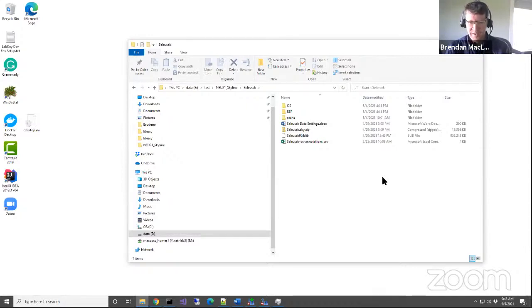One time we had this data set where Bruker came and said, "Oh, Skyline's not doing very well in this data set," and it turned out it was this very strange mass calibration where it actually was curved. That's why we have the 2D plot. On the low m/zs, the mass error was quite a bit higher than on the high m/zs.